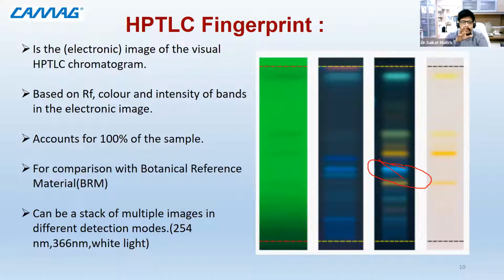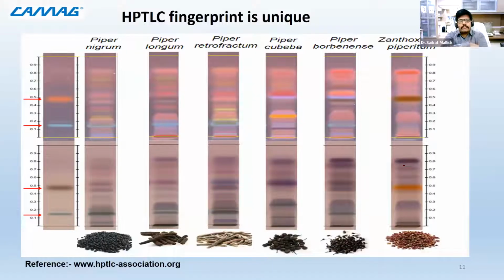So it is very important. I just thought of explaining you this. And also it helps you to see the variation across various samples. So you may be devising a formulation, you may be devising a raw material, or there are different stages at which a product is formed. The initial stage where raw material is there, then the mixing stage is there, then the final stage.